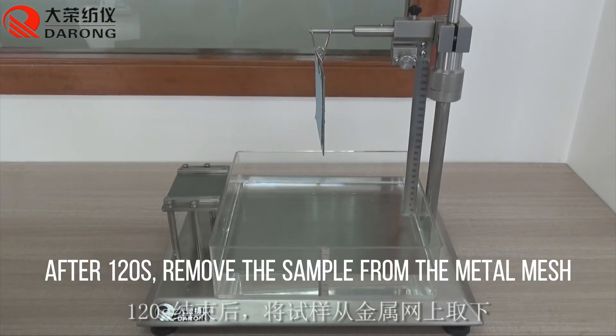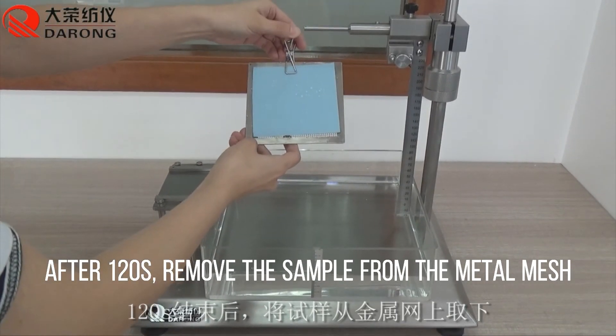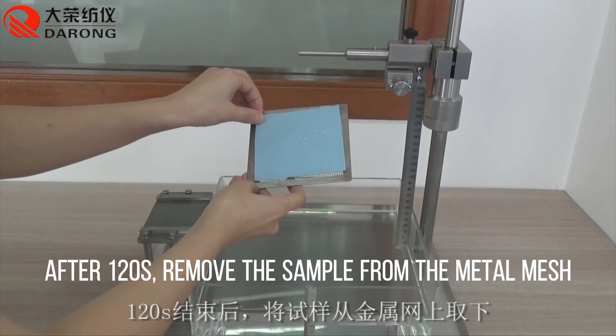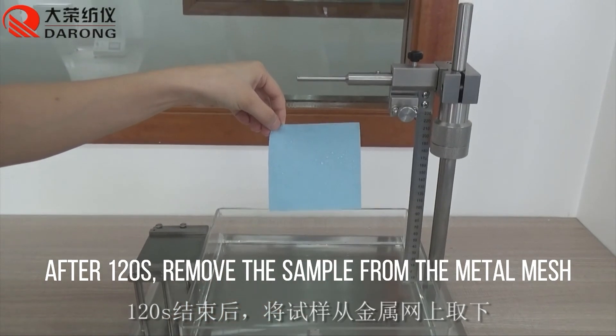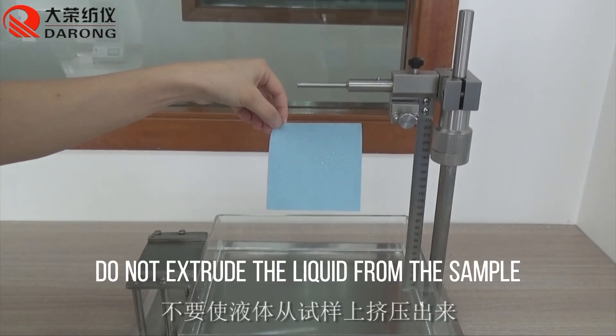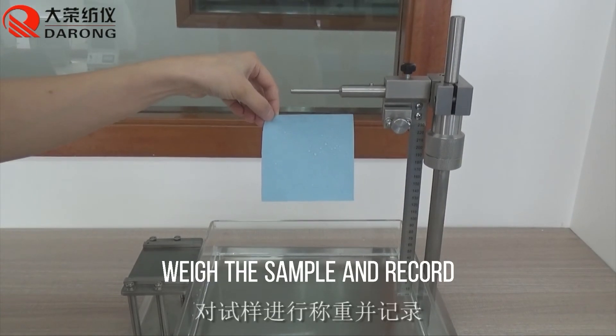After 120 seconds, remove the sample from the metal mesh. Do not squeeze or extrude any liquid from the sample. Weigh the sample and record the result.